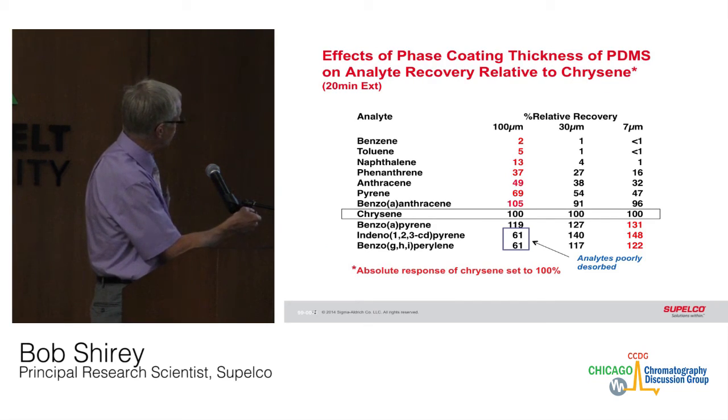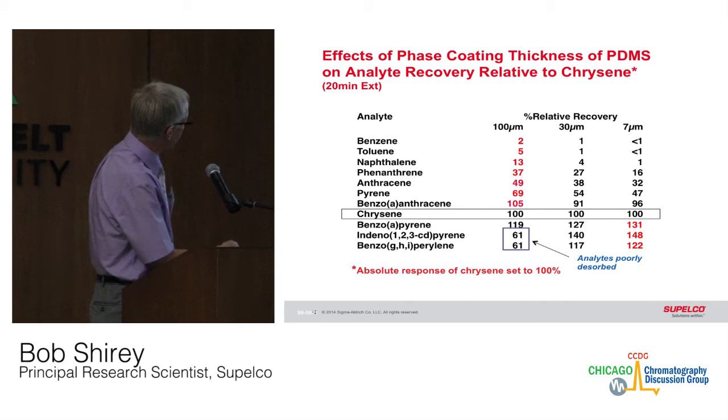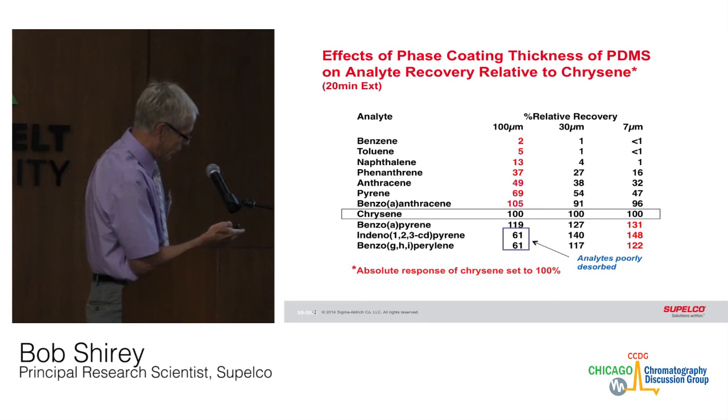This shows the aromatics from 1 ring out to 6 rings. You can see the 100 micron does better for these, for 1 up to 5 rings, whereas it has problems desorbing the 6 ring PAHs, where the 7 micron does very well at desorbing these and poorly retains the smaller molecules. The 30 micron is a nice compromise.